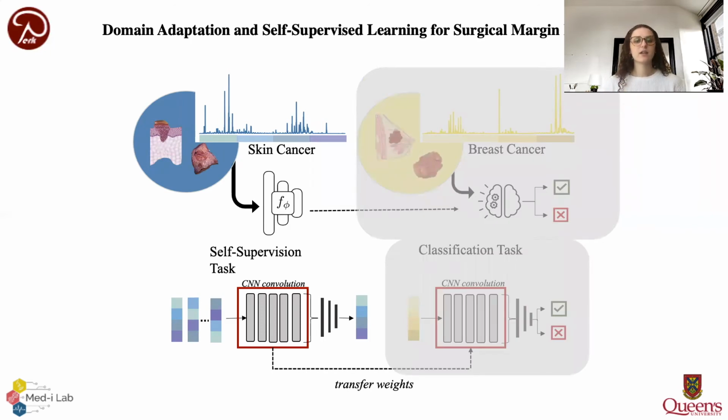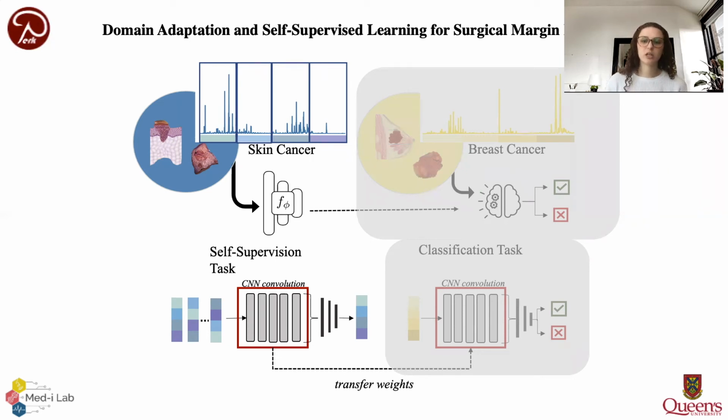The central idea of the relative patch algorithm is that there exist intrinsic positional relations among the divided patches of a sample. In the context of REIMS data, the placement of those peaks at certain mass to charge ratios and the intensity relationships between the different peaks across the spectrum can be chemically significant. In other words, the low-level features that are learned during self-supervision are associated with signatures of biological tissue.